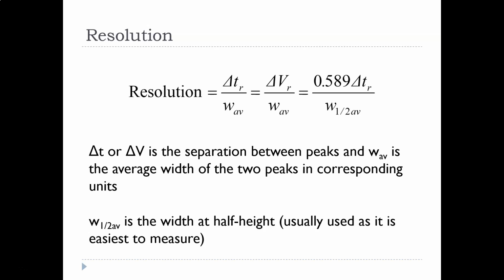So resolution, we're going back to talking about these peaks. Resolution is looking at the difference between the peaks. If we have 3 components, we want to see in our mixture, we want to see 3 clearly defined peaks. 1, 2, 3. I don't care how far apart away they are, as long as the end of one peak goes down to 0 before it goes back up. What we don't want to see is that.